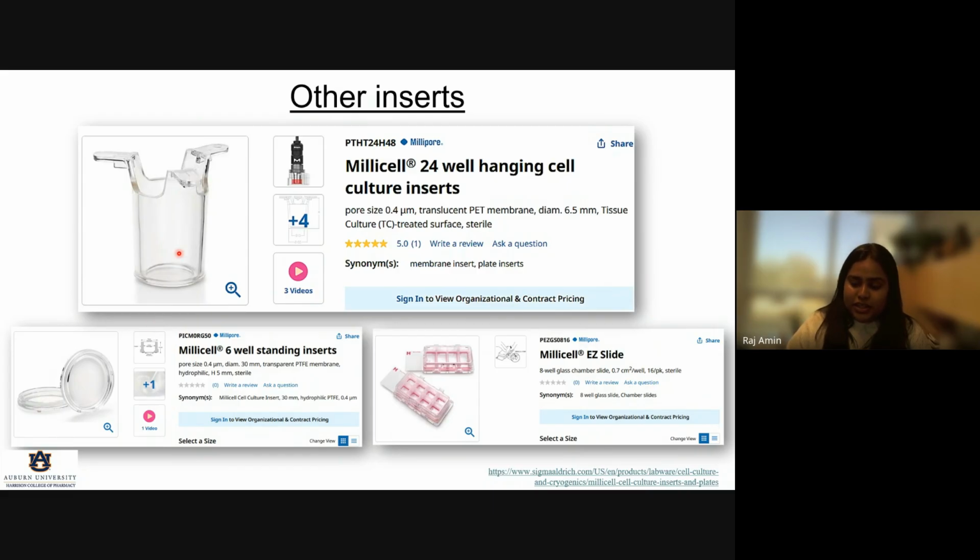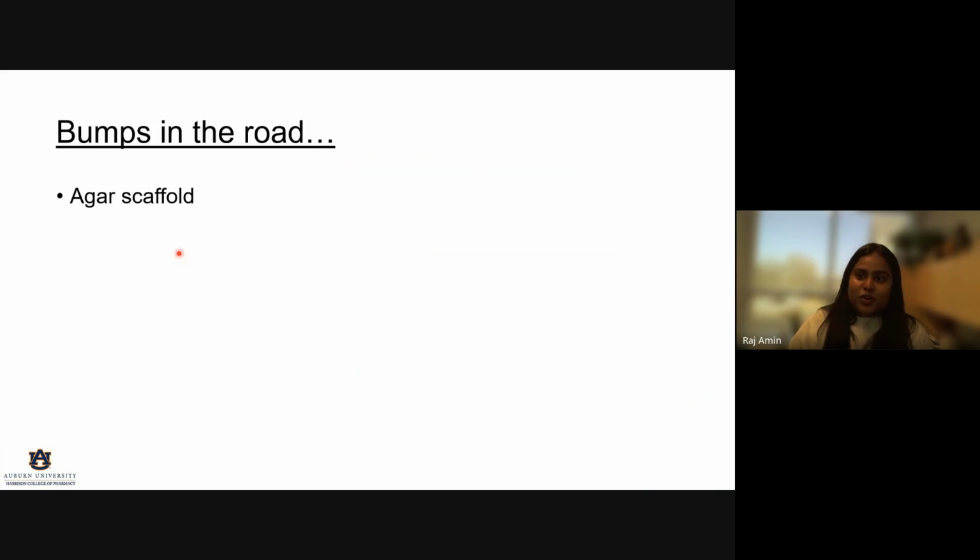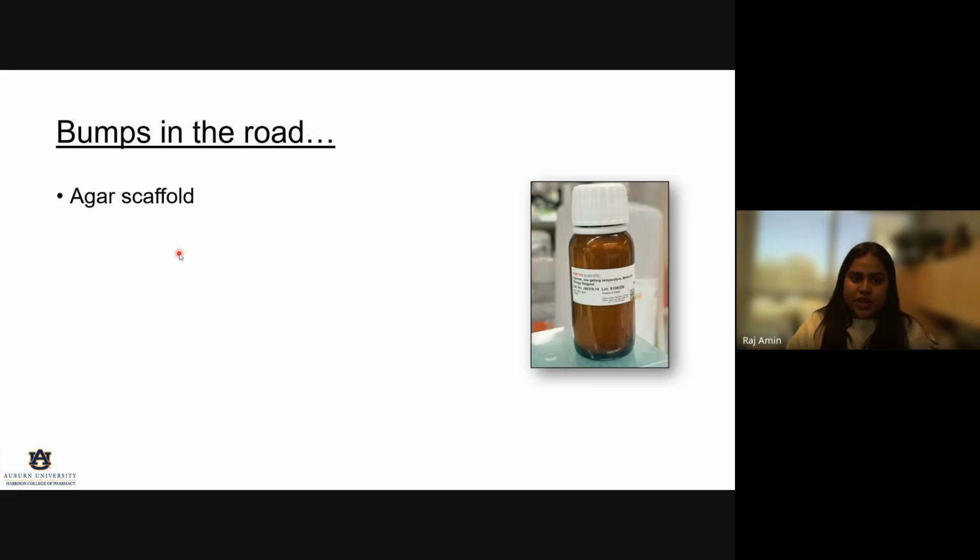Following this, as every journey has its own roads and bumps, even our journey with organotypic slices had its own bumps in the road. To begin with the first one, the agar scaffold. While slicing these brain slices, we have to mold them into a special form of agar. Initially, we tried using 5%, 2%, 1% regular temperature agar, but that failed us in creating even slices. And also the heat produced by the agar caused damage to the cells of the brain. So that's when we shifted to this specific low gelling temperature agar, from Thermo Scientific, which solidifies at 36 degrees Celsius and then stays solid even at room temperature. This helps us to create a scaffold which is not of higher temperature and prevents damage to our brain cells.